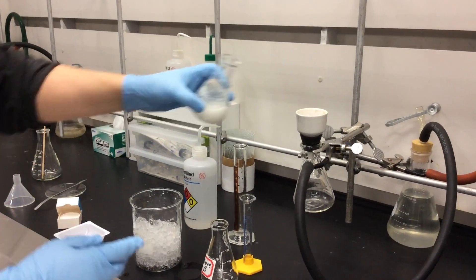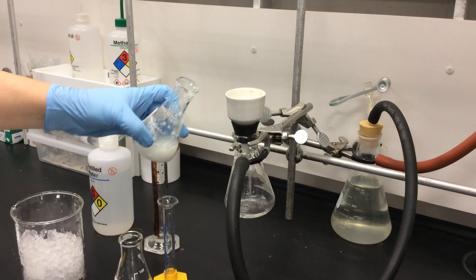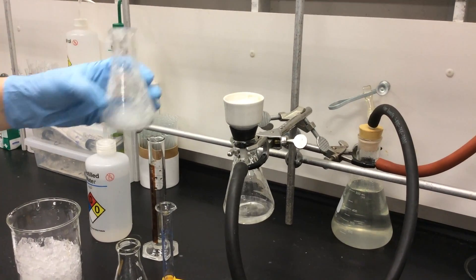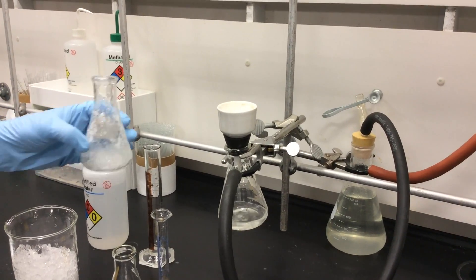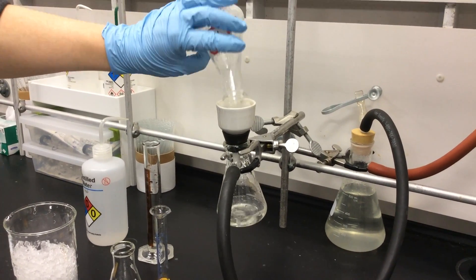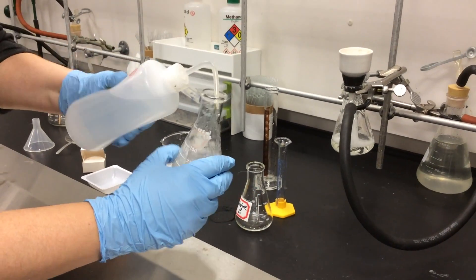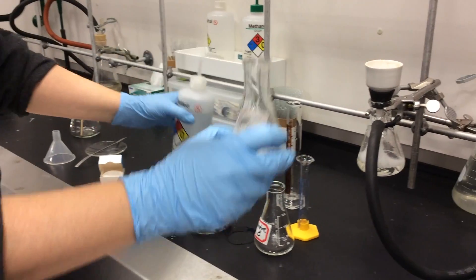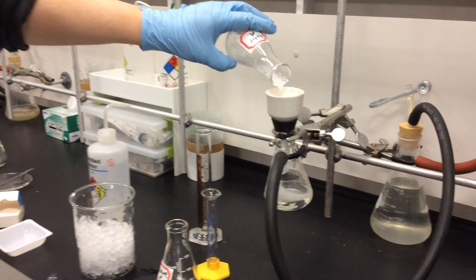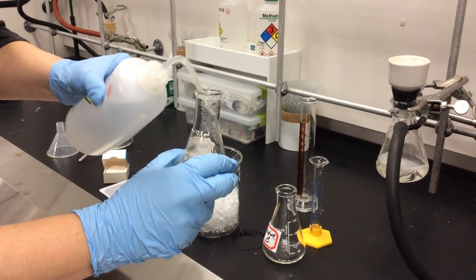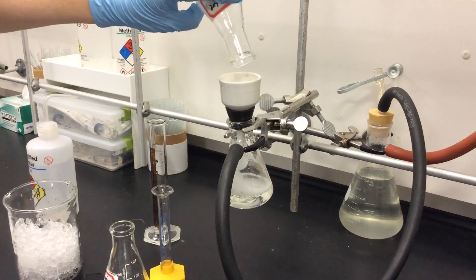Now we're ready to filter our acid anilide. We pour it into our Buchner funnel. As you can see, the crystals are staying inside the funnel, and the liquid is being separated from the crystals and falling to the bottom of the flask. To get all the crystals out of the original Erlenmeyer flask, you can rinse the flask with a little bit of water and just pour it into the Buchner funnel. And this is how we isolate our acid anilide.